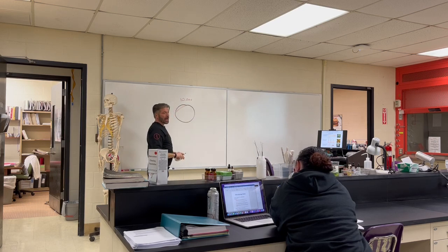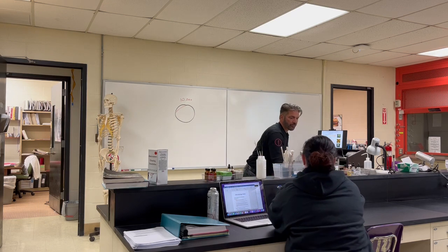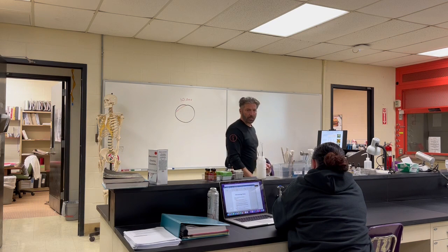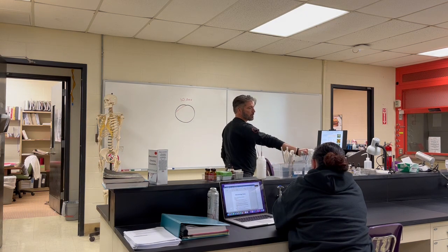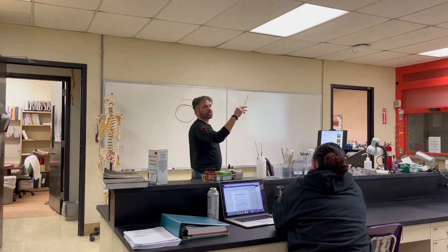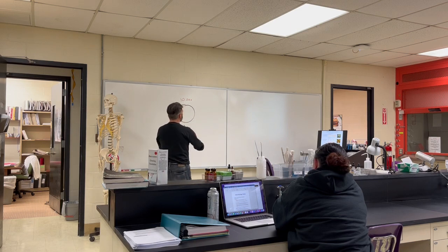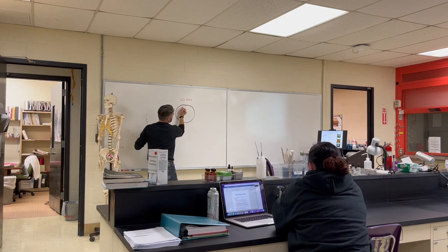Now I'm going to come over here, and this is lit. I'm going to take my inoculation loop. It's red hot. I hold it up. How many bacteria on it now? 0. So I'm going to take this, and there's none on it, and I swab it like that.